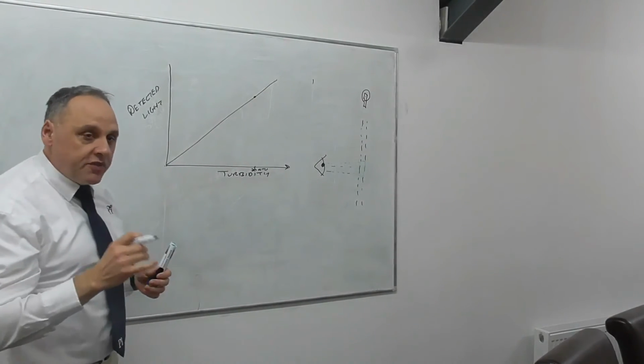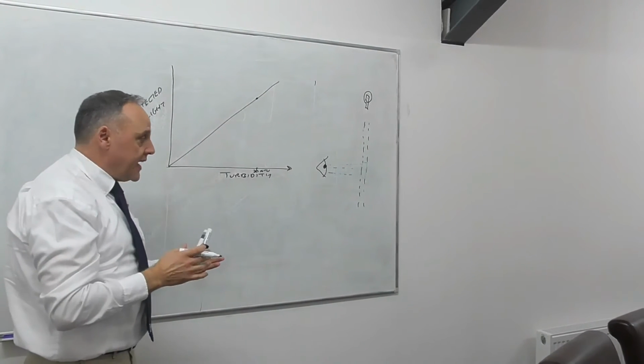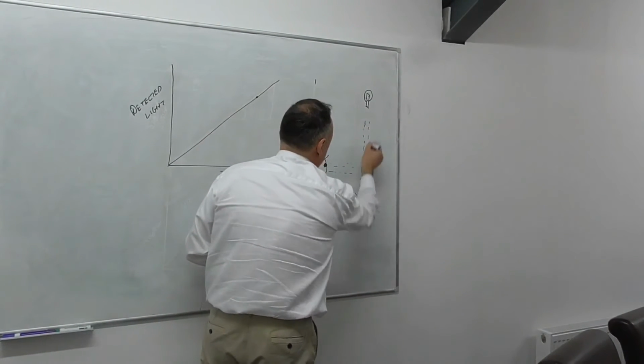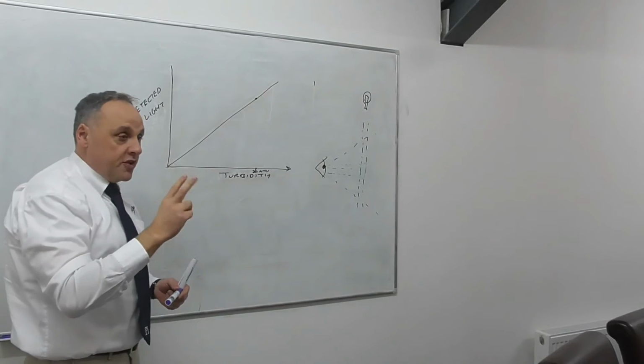And it changes over time through noise in the electronics, through variances in the light source and in the detector, and also if there's any stray light, which is light coming from anywhere else into that detector that we don't want. So manufacturers do one of two things.